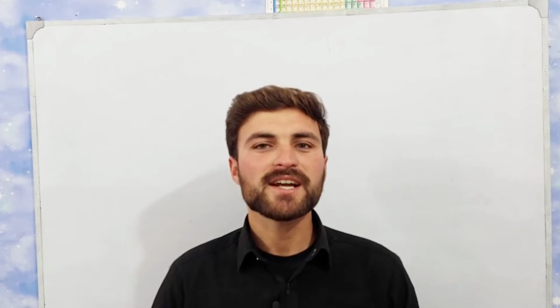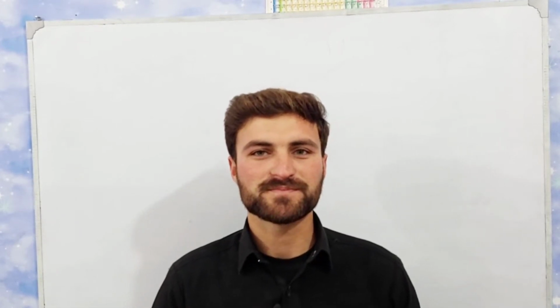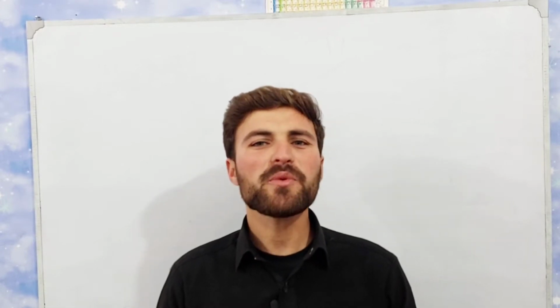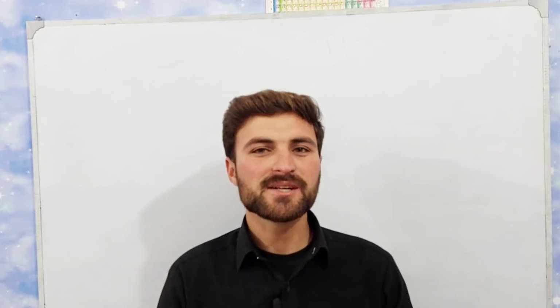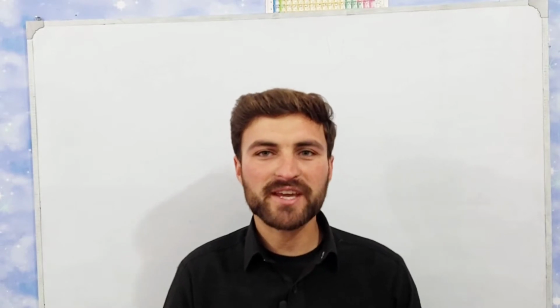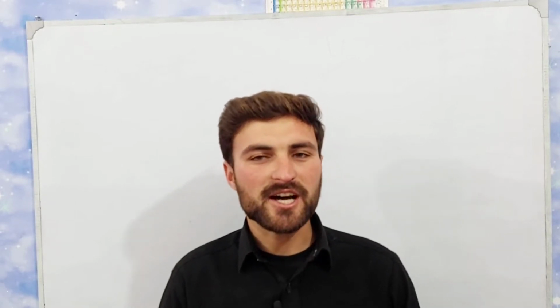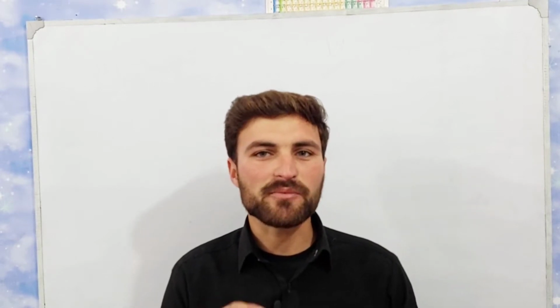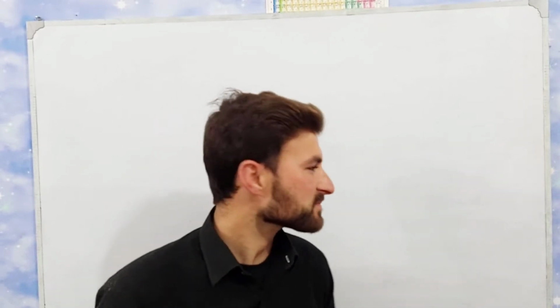In this lecture, I am going to discuss some basics about the microscope. Like what is the root meaning of the microscope, how we can define the microscope, why we are using the microscope. And in this question we will discuss the basic properties like magnification and resolution. And at the last of the video we will also discuss the lenses of the microscope. So let's start the video.